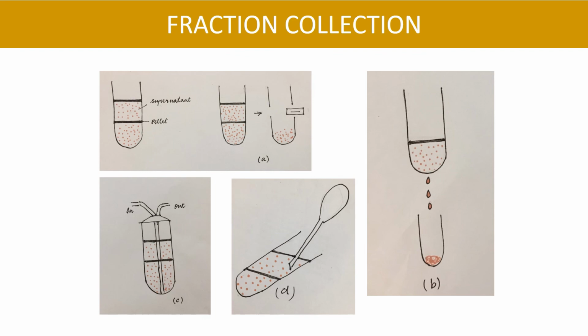The third method to collect a fraction uses a small gadget, which you attach on top of the centrifuge tube. Remember, the heaviest density is at the bottom. So you pump in a density material still heavier than that, and it will slowly push the contents up. The lightest material will flow out through the outlet you see in the figure, and you keep on filling the heaviest density until the precipitate of your interest is pulled out of the centrifuge tube. That is another method.